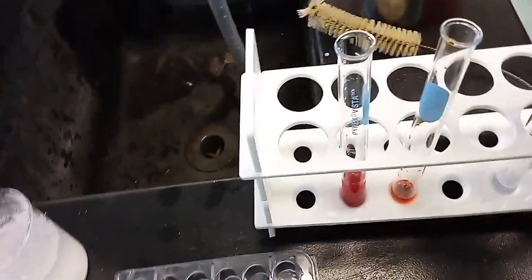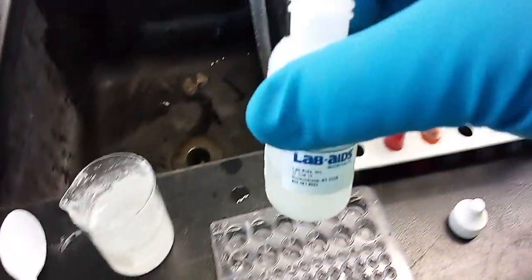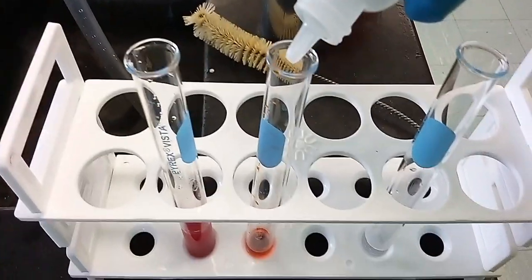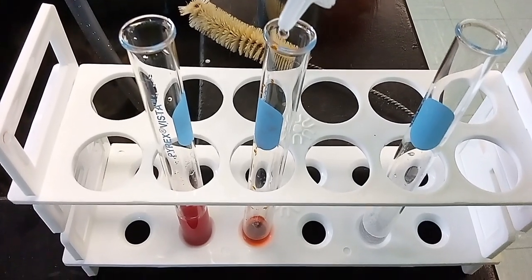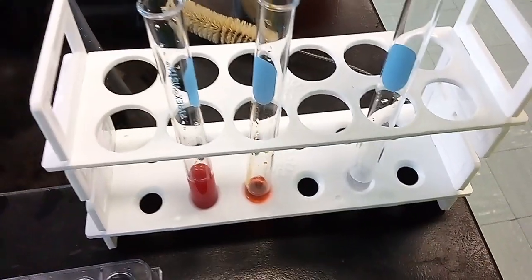Now if I add a base, it will turn yellow. So I have a base here. I have some of the potassium hydroxide that I was using in the previous experiment. I'm going to add a drop, and you should be able to see this changing color. So it's orange. And then we're going to add, I don't need to add a lot, but you can see it.